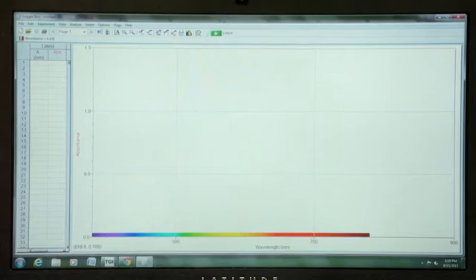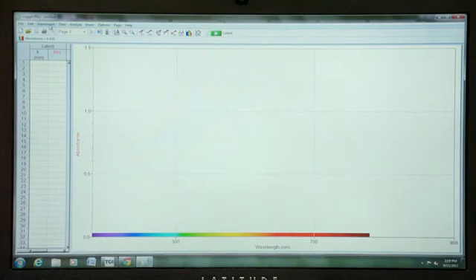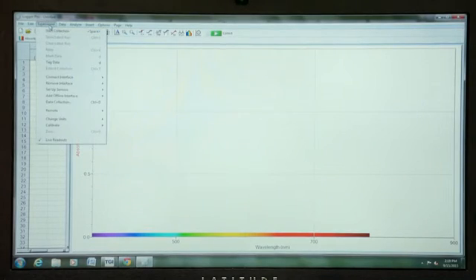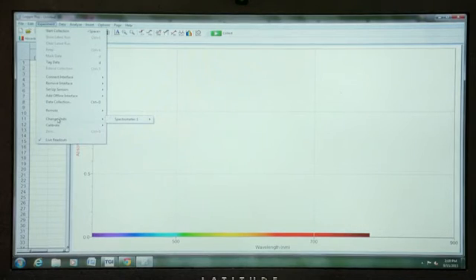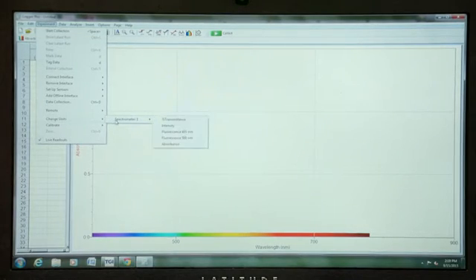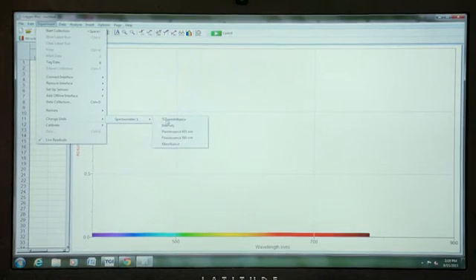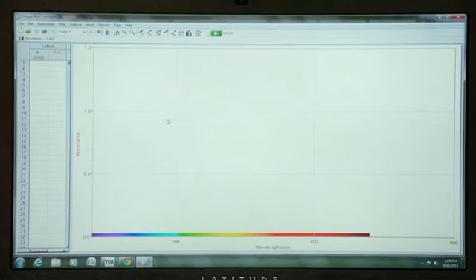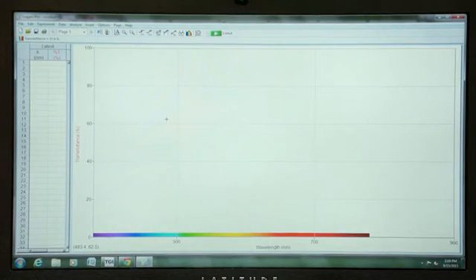In order to take measurements in an appropriate unit of measurement for this experiment, we will again go to the Experiment menu in Logger Pro and this time choose Change Units, Spectrometer, Percent Transmittance. We're going to measure in Percent Transmittance.